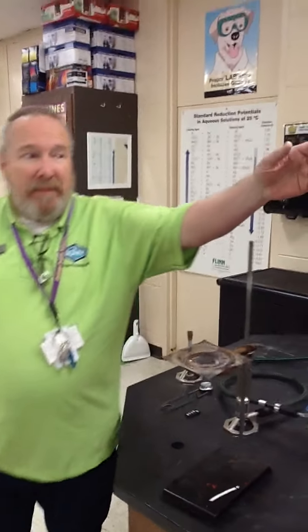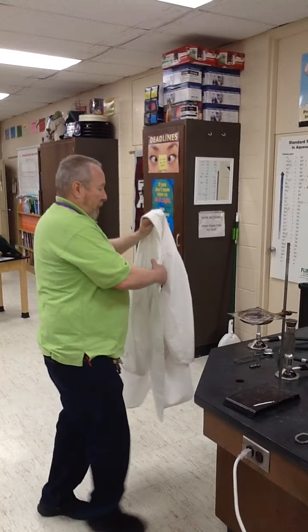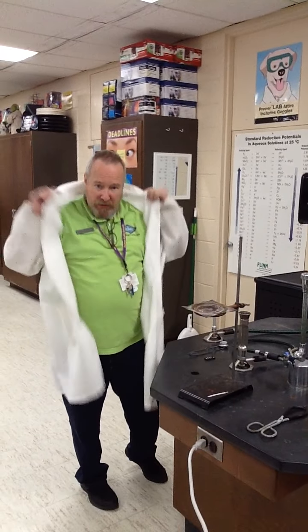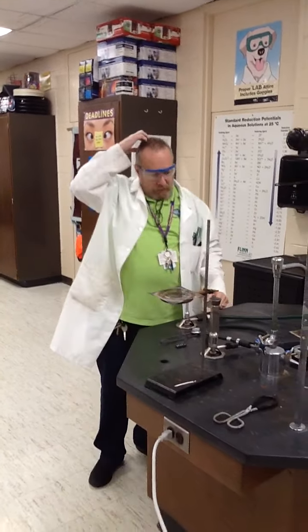And so, I'm going to put on my lab coat, and we have safety glasses and safety goggles in the cabinet, but me being an instructor and using them all the time, I don't need to sterilize mine between uses. I use my own pair all the time. So, can you zoom in a little bit?